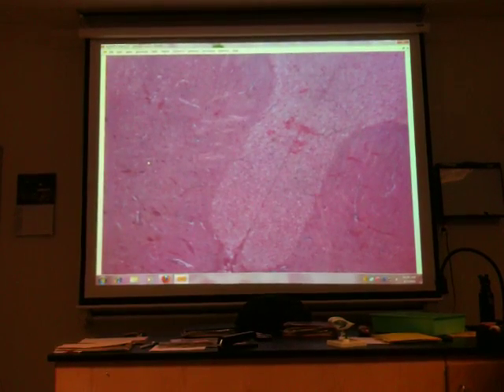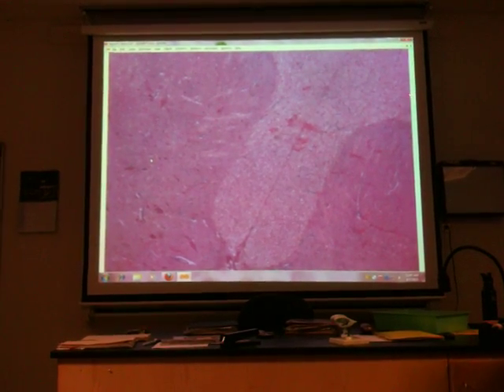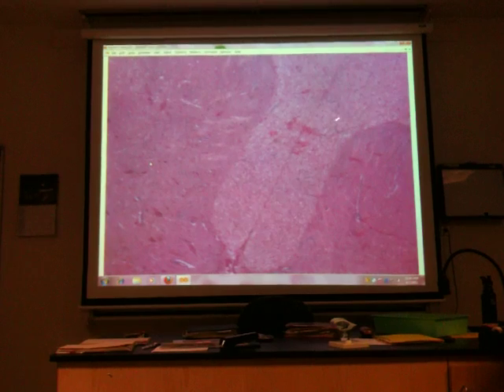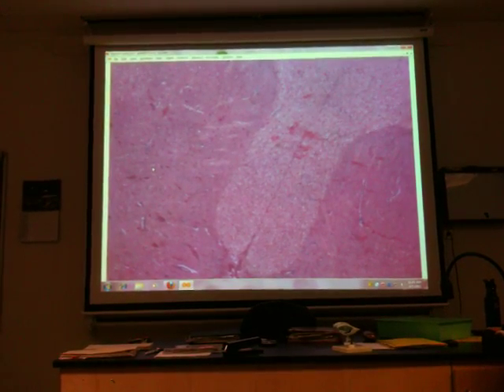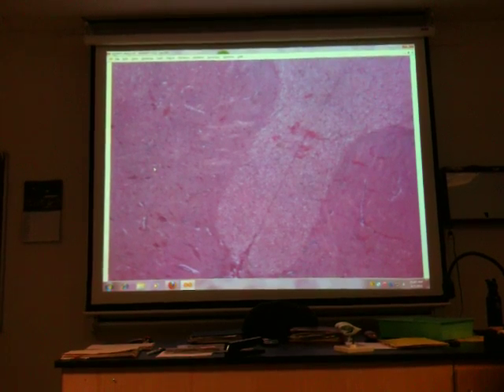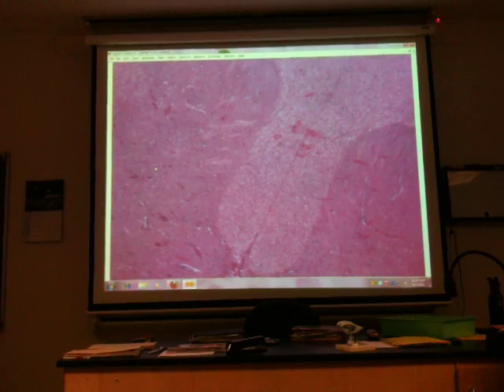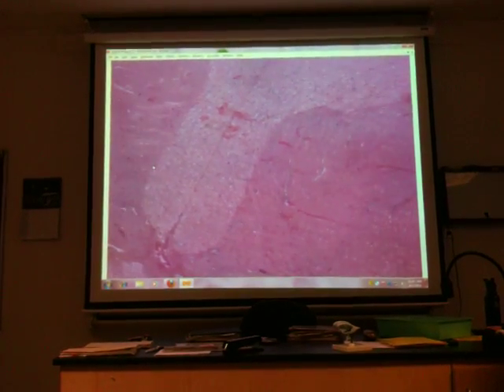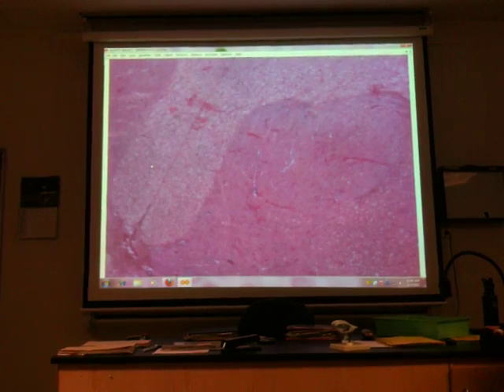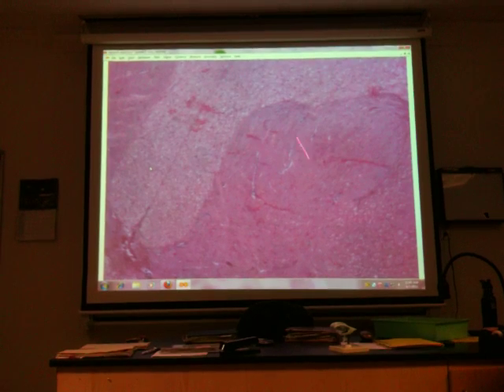So that means that, actually let's stay here, that means that this structure is called what? Posterior white column. Shelby got it? Posterior white column on one side and on the other side, coming up to the surface out here. Okay. So let's come over here and let that back table name this shape.